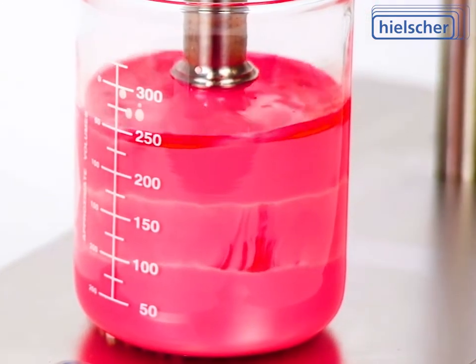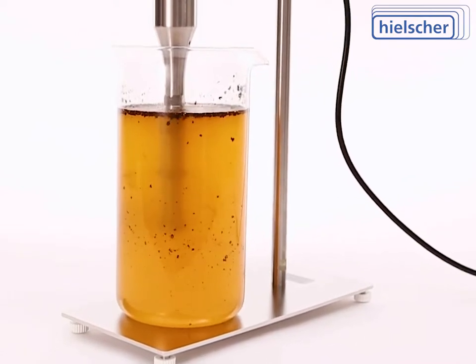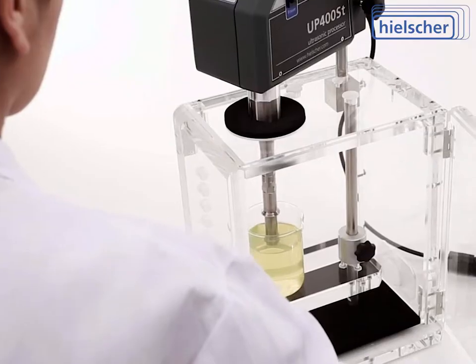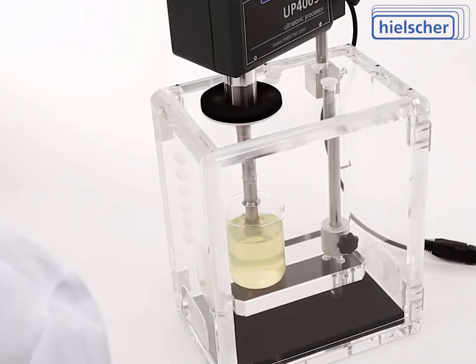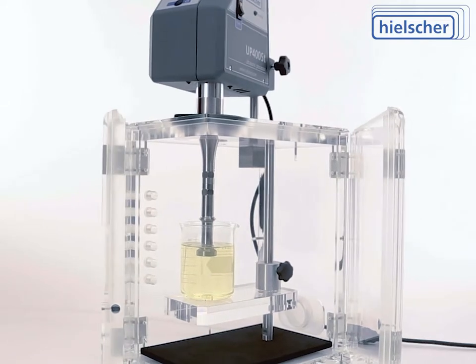Dedicated to quality and performance, Hielscher specializes in ultrasonic equipment for liquid processing. Hielscher has three decades of experience — from design and engineering, through manufacturing, assembly, and packaging. The UP400ST is a high-quality ultrasonicator entirely made in Germany.